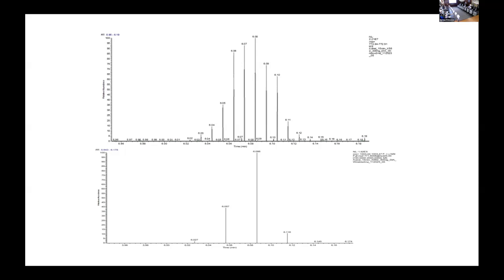If you actually look, there are 3 points that cover the vast majority of the quantitation. If you look down at the baseline, this is technically 5 points across the peak, because I've got numbers there, maybe even 6 points across the peak, but all the quantitative value is present in 3 of those. And 75% of it is present in 1 scan. So this is not optimal, right?